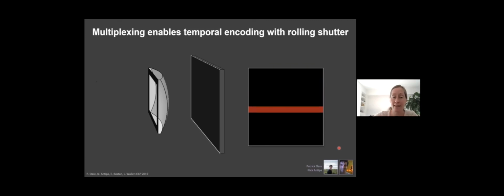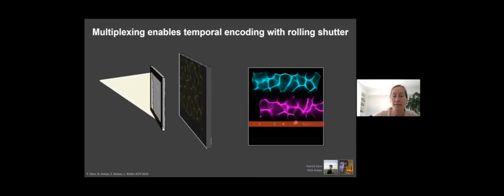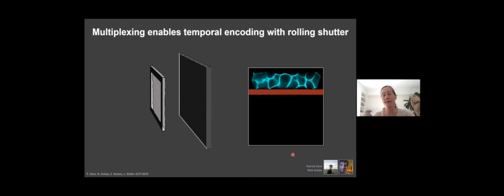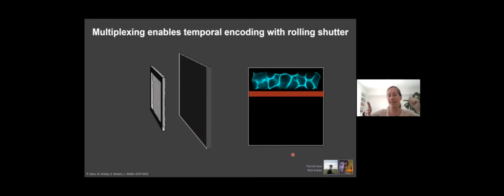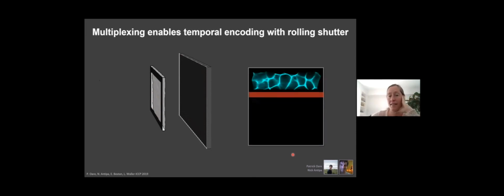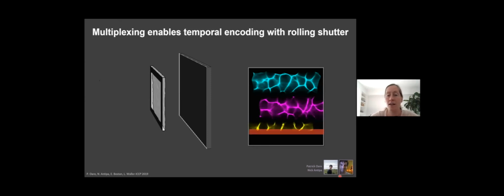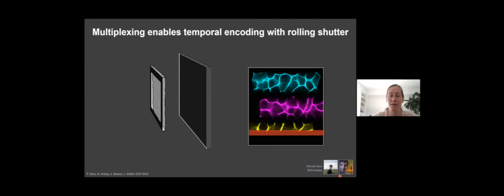This is an irregular lensed imaging system. In the DiffuserCam, stuff is happening while the sensor is rolling its line down the frame, and there's always something about it captured because every point in the scene maps to the entire sensor. So no matter where in the scene something is happening, you get information about it on the sensor because it covers the whole sensor. So Patrick, who was an undergrad for the summer, worked with Nick on trying to solve this as basically a 3D inverse problem where you solve for 2D plus time instead of 3 dimensions.